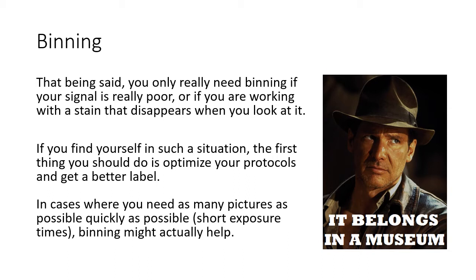If you find yourself in such a situation, the first thing you should do is optimize your protocols or get a better label stain. Only when this doesn't work out should you resort to binning. Also, in cases where you need as many pictures as possible, as quickly as possible, binning might actually help, but of course you also lose resolution, so that might not actually end up helping you at all.